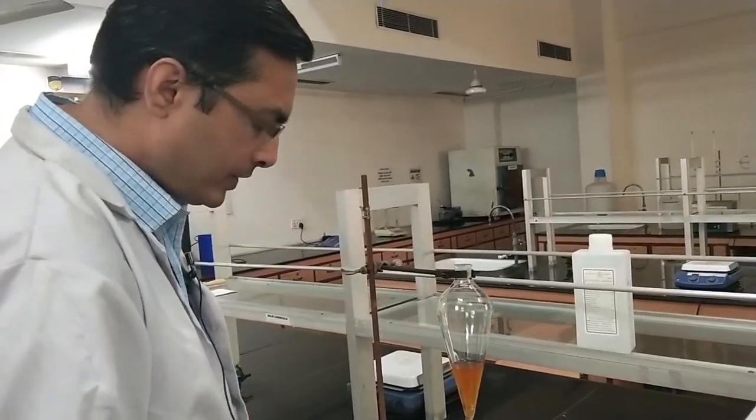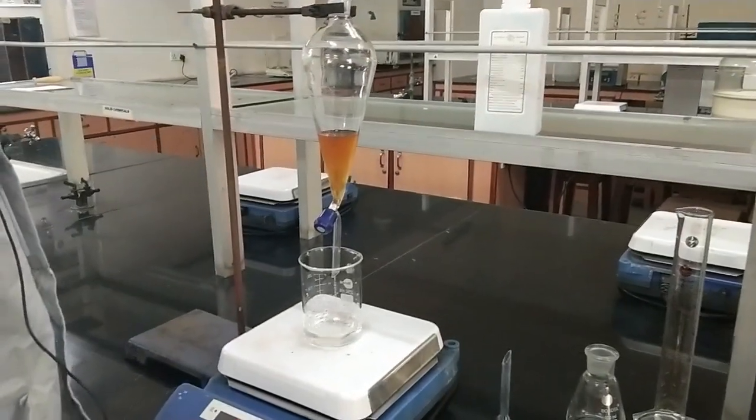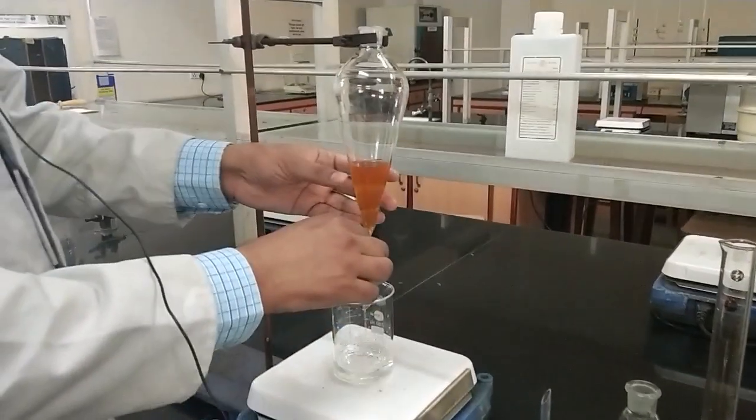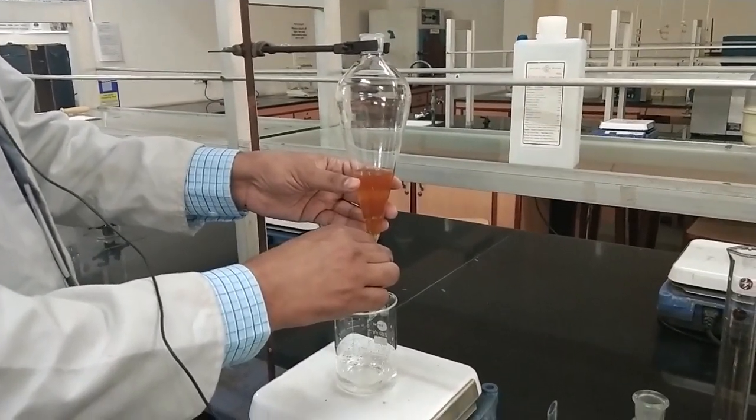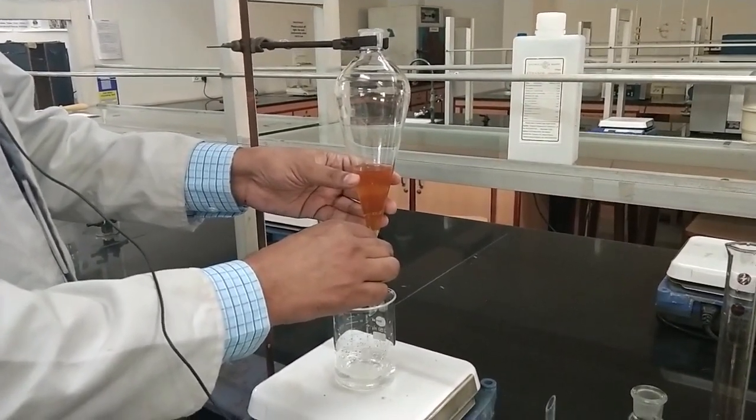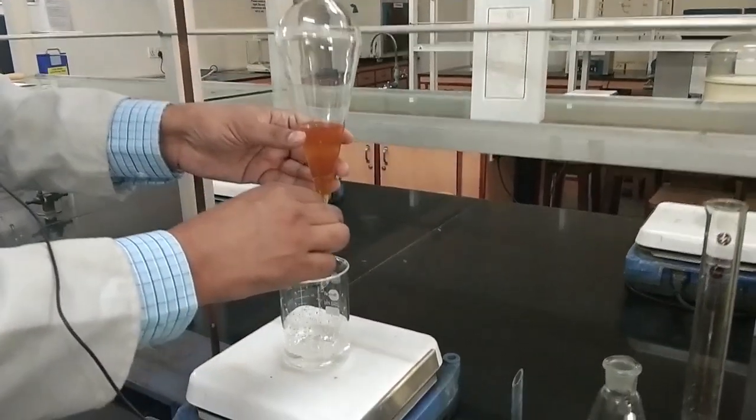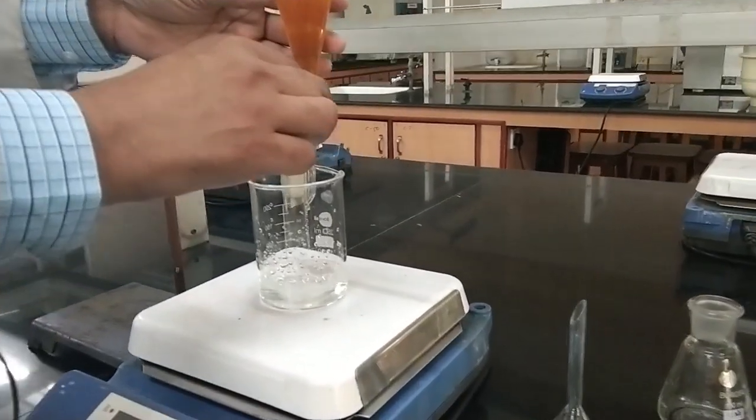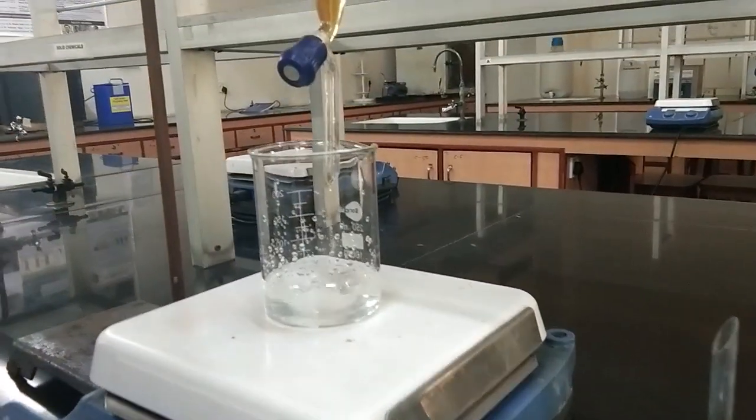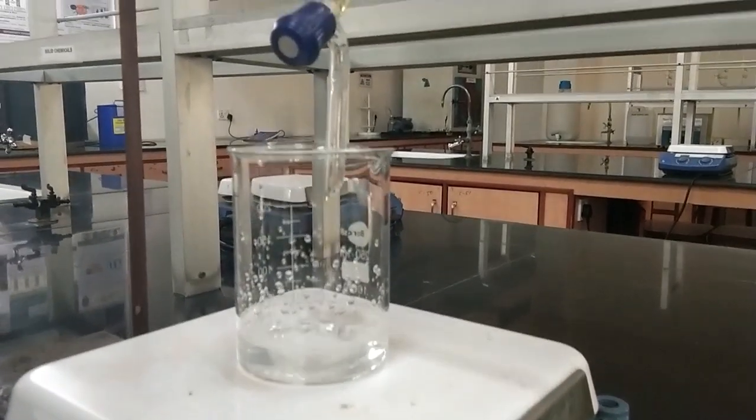We turn on the stirring and now we very slowly open the separating funnel so that slow addition of sodium pyrophosphate takes place. The slower you add, the smaller nanoparticles you will get.